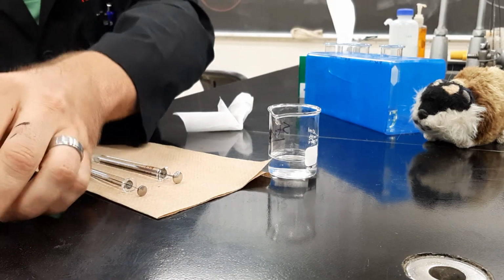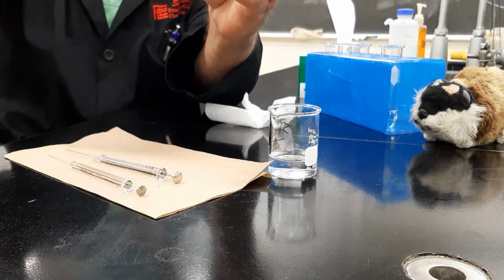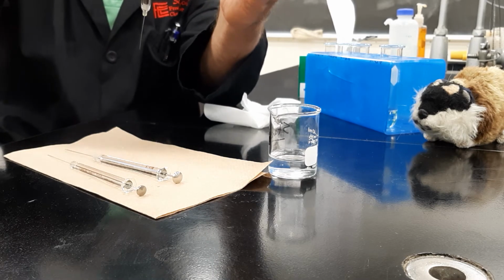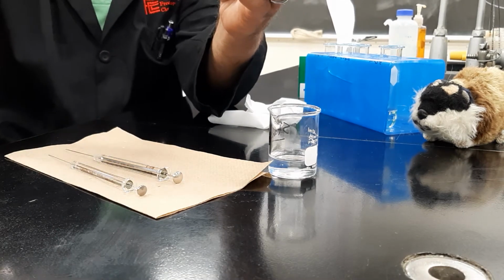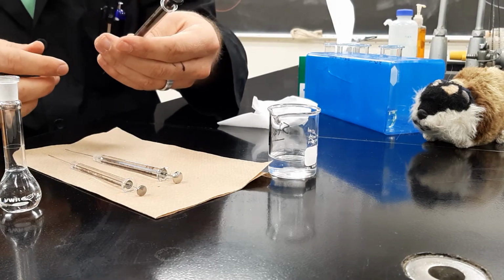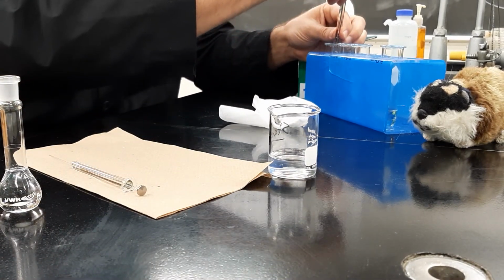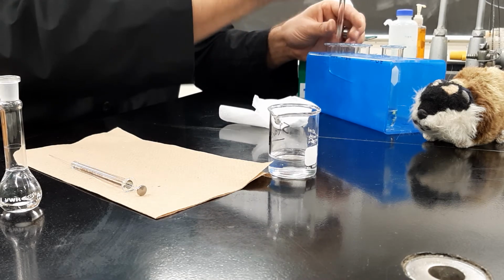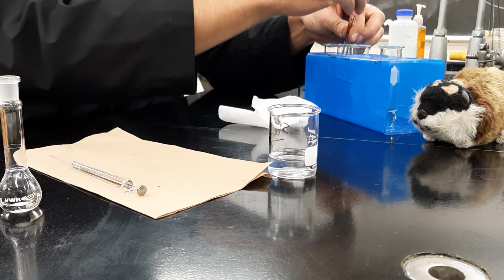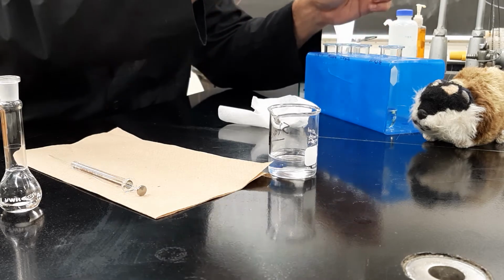Generally, when you dispense, you'll dispense under the surface of the liquid that you're dispensing into, so that if anything is volatile in what you're putting in, it's trapped in the solvent and not spraying around in the neck of the flask. They come in different sizes. This one works pretty easily, as you've seen. This is the medium size. This would be a 100 microliter syringe. And it works about the same way. There's nothing super complicated about it.